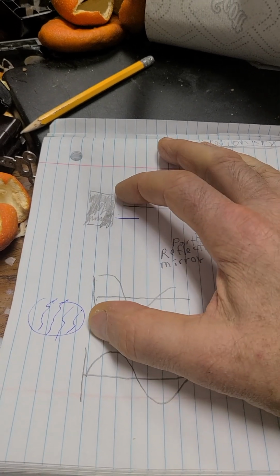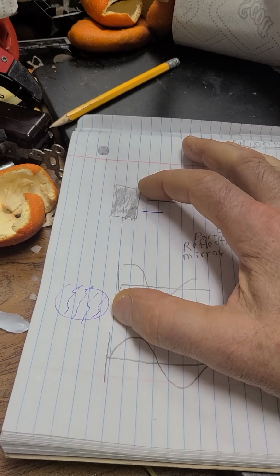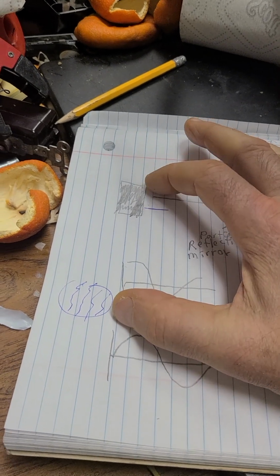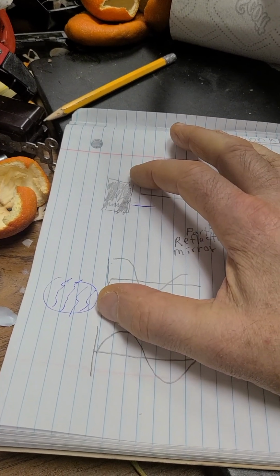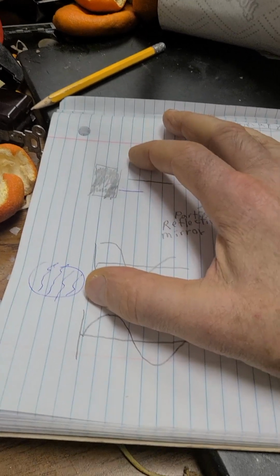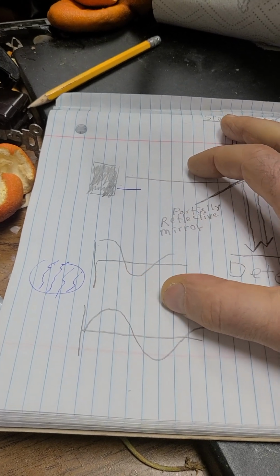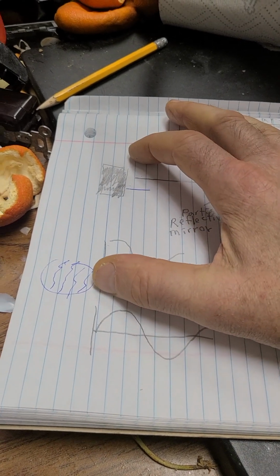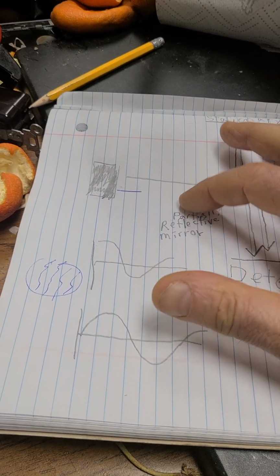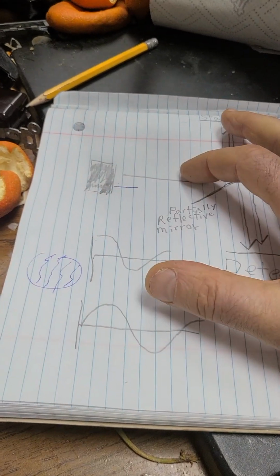If we had zero distance moved, of course, and recombined it at the zero distance spot, the difference is zero, then they would both combine and add together to create a more powerful signal shown on the scope. But the question may be, how far out would you have to go until the signal would be opposite, so it would have destructive interference? And it's a certain distance out based on the wavelength.